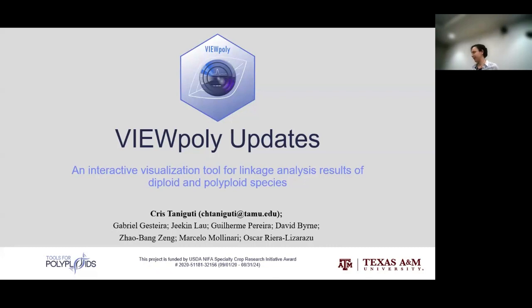Okay, nice. And we heard about the complicated things. Now it's the pretty part. So I will talk about work that we developed together with Marcelo. Actually, it's a collaboration between us and Texas A&M and NC State. And it's an interactive visualization tool. It's a Shiny app to display the results from all the software that we are talking about.